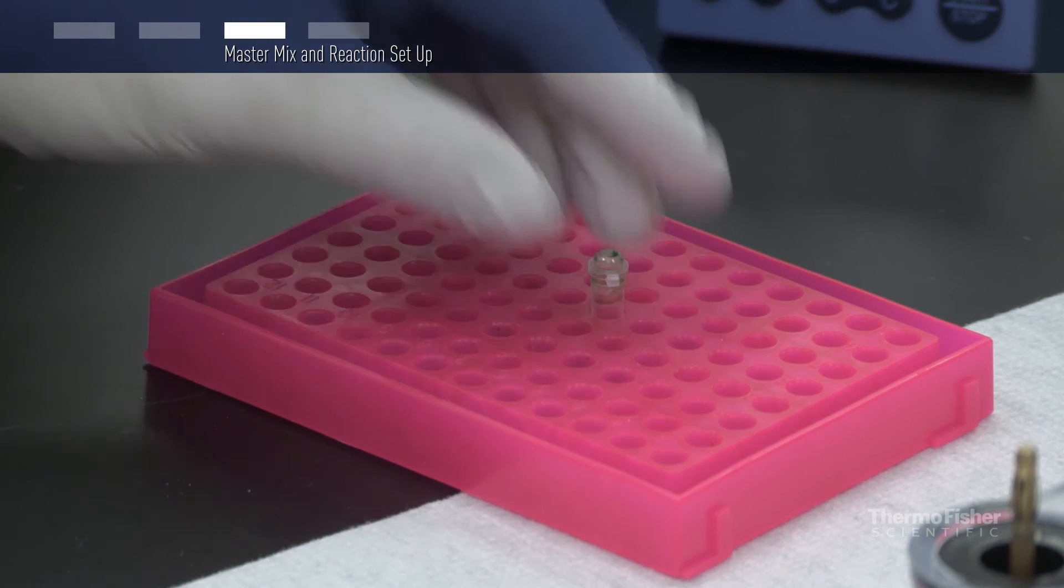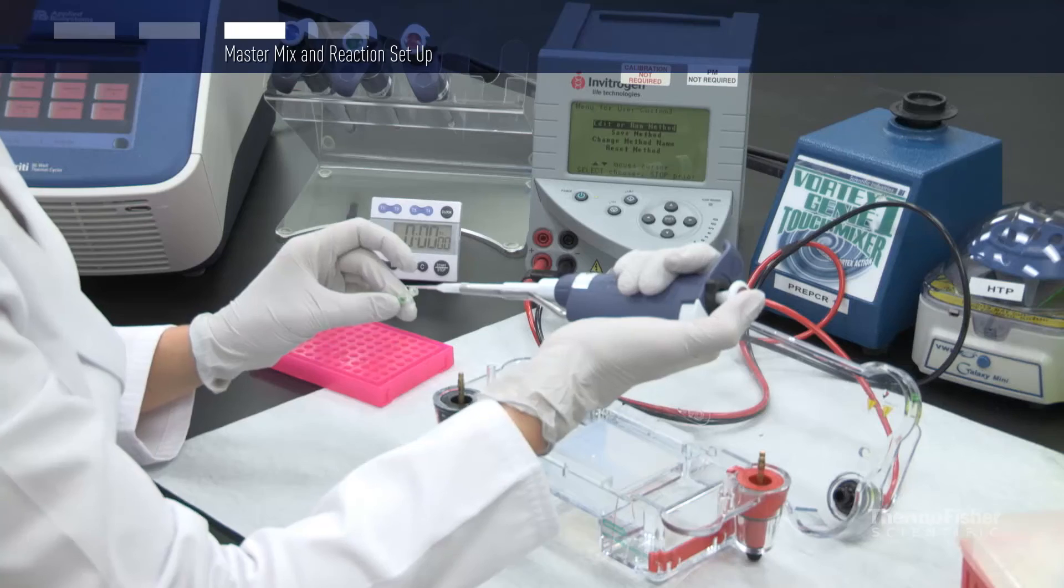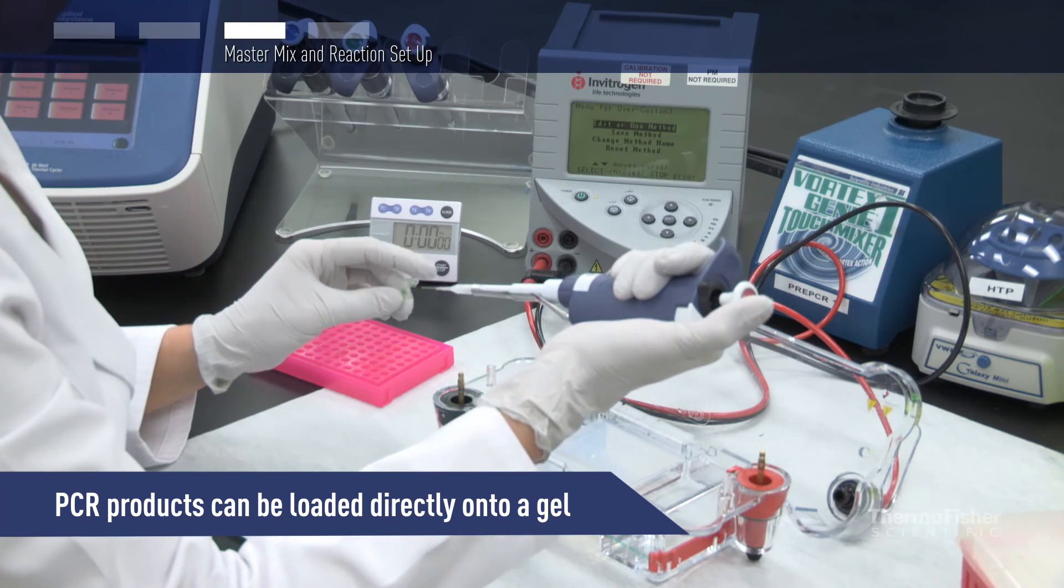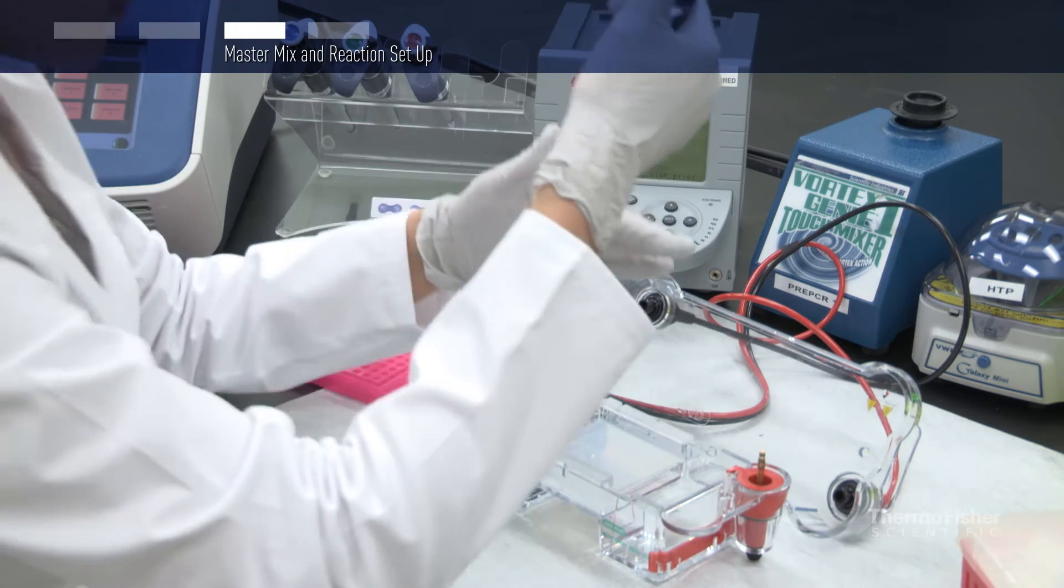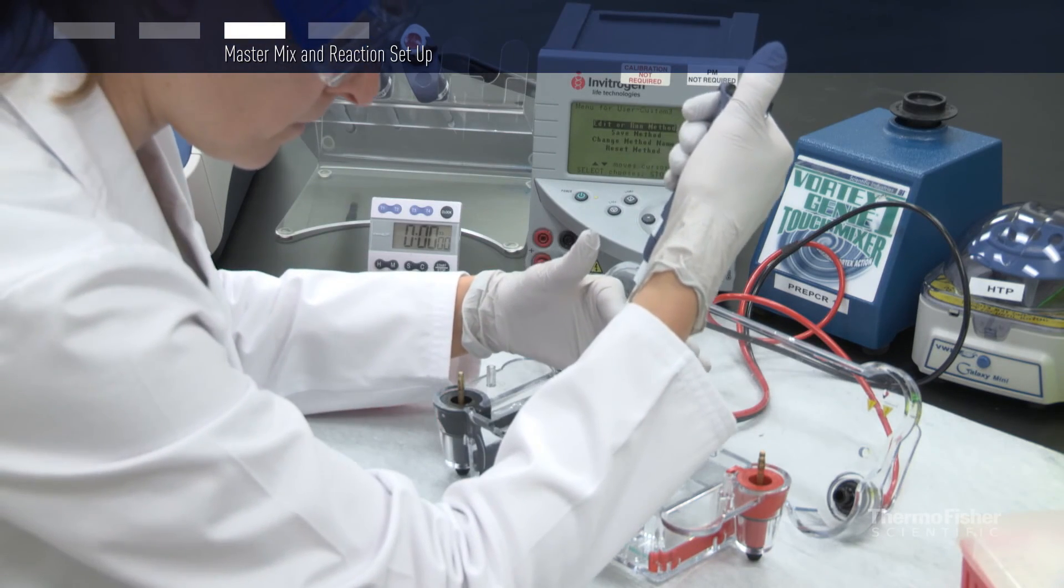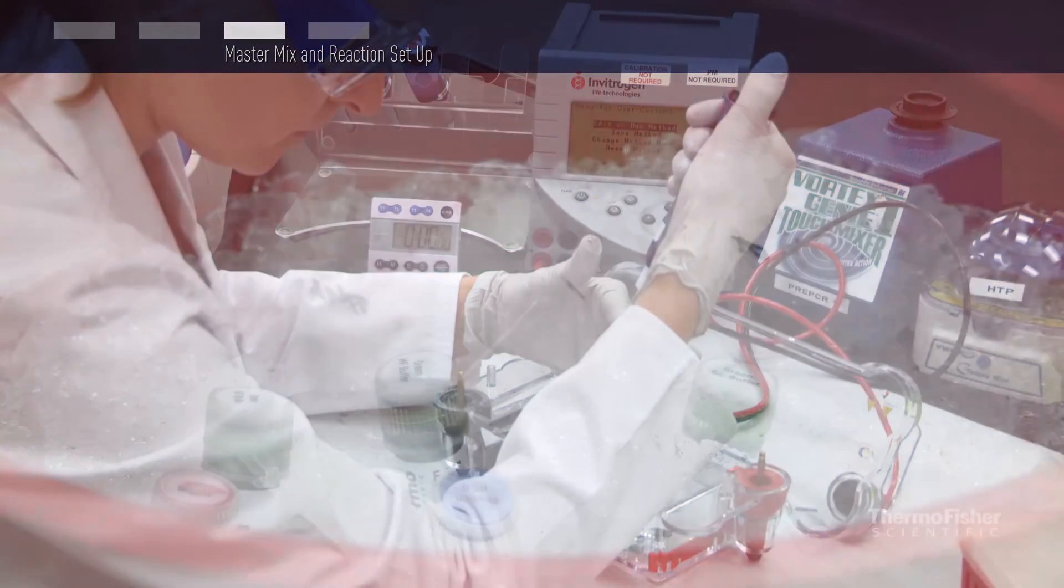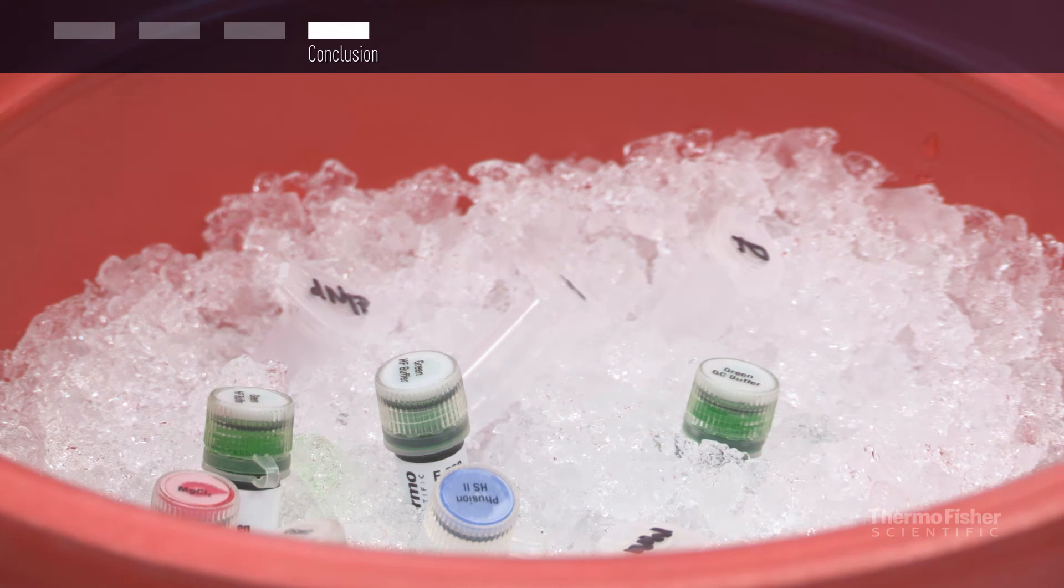If using Fusion Green polymerases, after the reaction is completed, PCR products can be loaded immediately onto a gel. The green buffer contains a density reagent that allows direct loading of PCR products on a gel and two dyes for monitoring of electrophoresis progress. The colored buffer does not interfere with PCR performance.